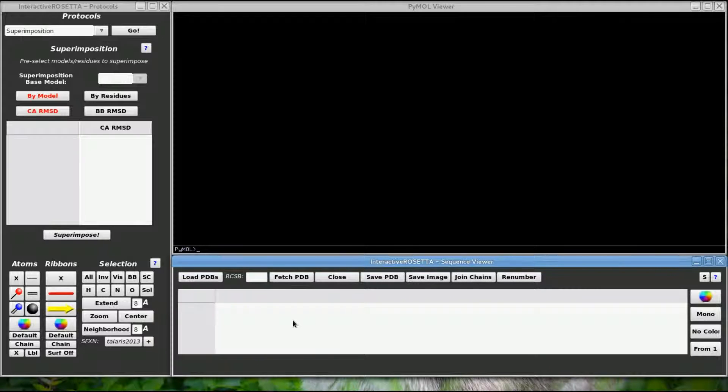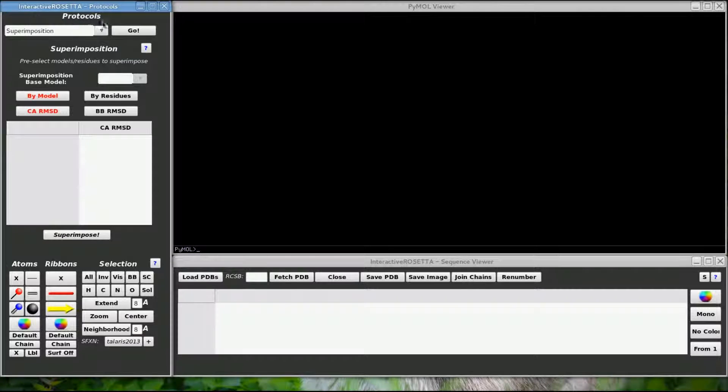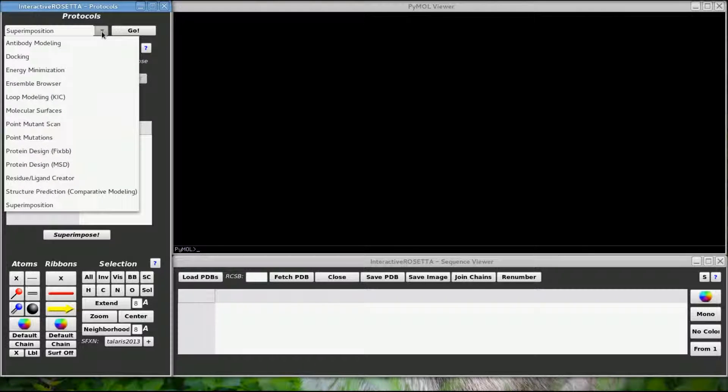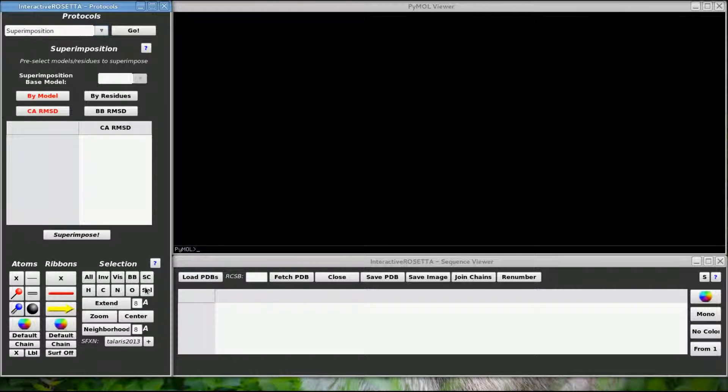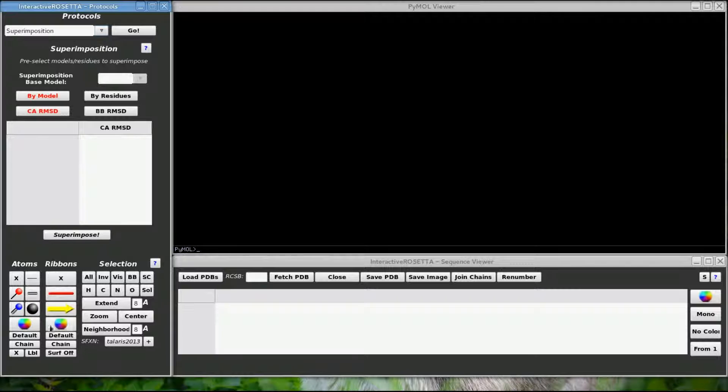The window on the left is the Protocols window. This is where you can set up and run all of the supported Rosetta protocols. The lower part of this window contains a lot of selection and visualization controls that I will be explaining shortly.